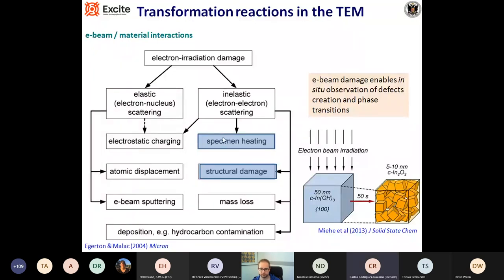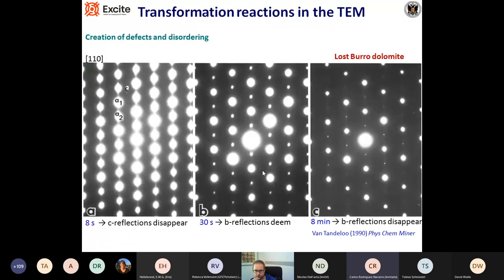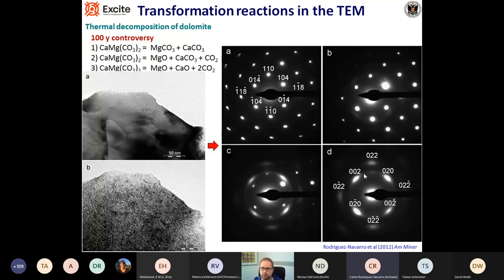We can also have transformation within the TEM due to inelastic electron beam interaction with the sample. This causes specimen heating and structural damage — breaking bonds or producing new bonding. This can be used to our advantage to study how a material behaves or how phase transitions occur. For instance, we can see the evolution of C-type and B-type reflections in dolomite just by beam damage — this can be very destructive, which we don't want — but in other cases we can use it to see transformation from one phase to another.